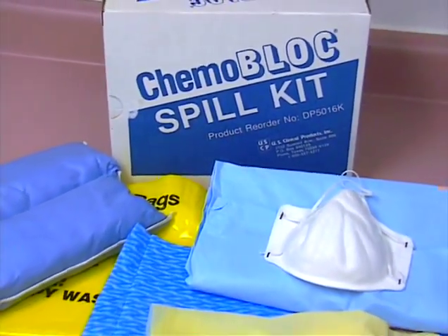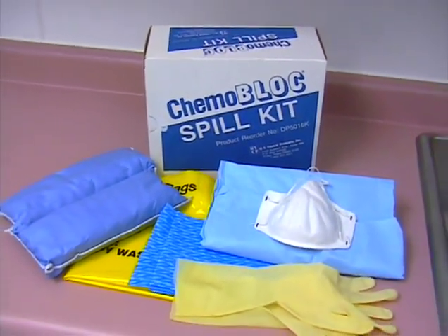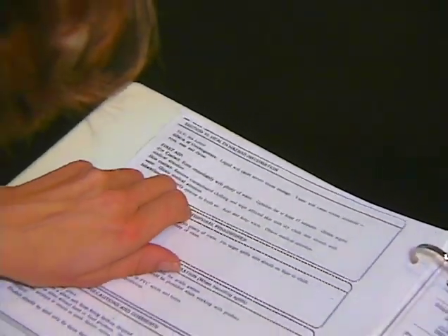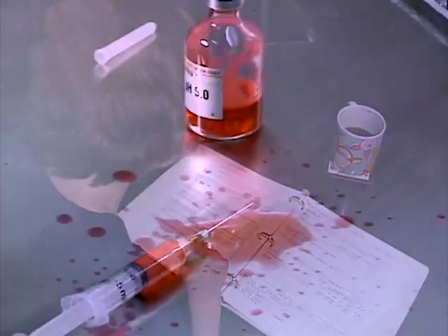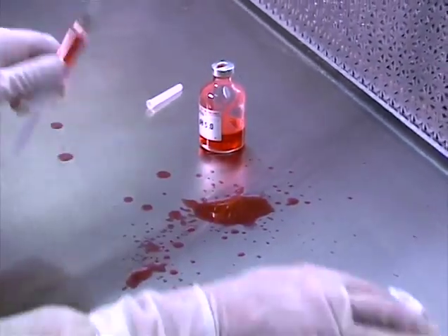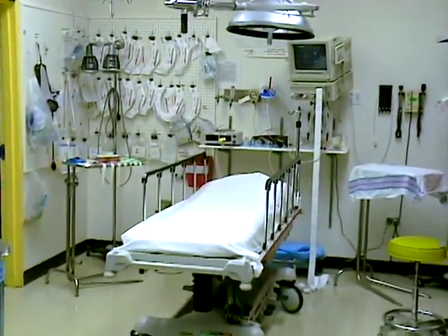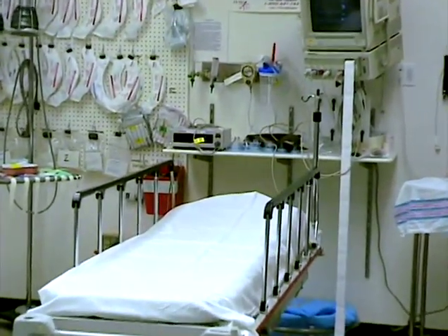All operators must be completely familiar with the substances which they are to compound and understand the emergency procedures required for each individual substance before compounding. Because time is of the essence in an emergency, it may be too late to familiarize yourself with and prepare for the specific emergency actions required after a spill or exposure has occurred. Also, emergency room personnel may not be familiar with the substances you compound.